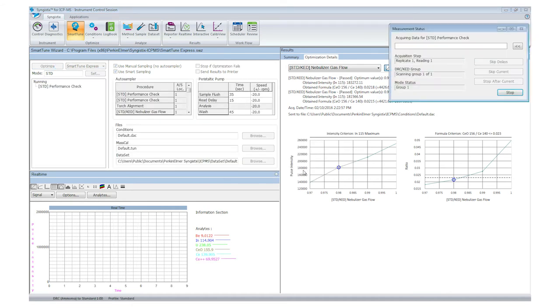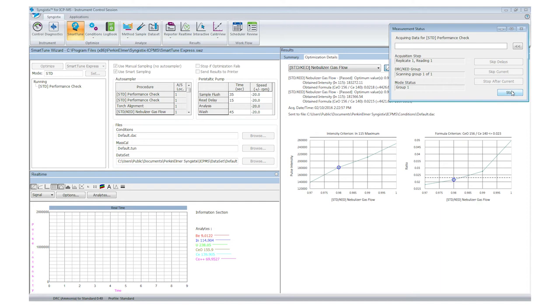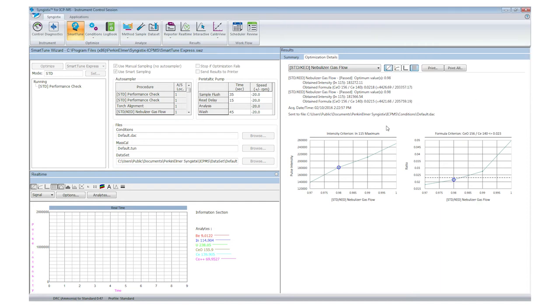SmartTune Express runs a series of intelligent optimizations, proceeding dynamically until satisfactory performance sensitivity and background levels are achieved. However, if you prefer manual optimization, this feature is still available by selecting SmartTune manual from the dropdown.